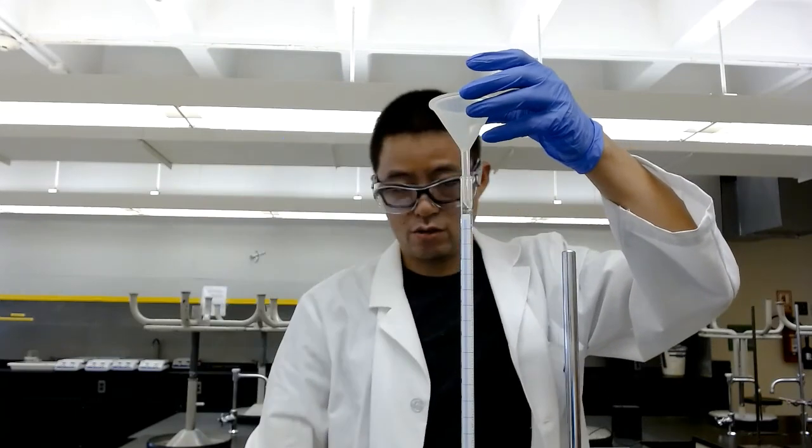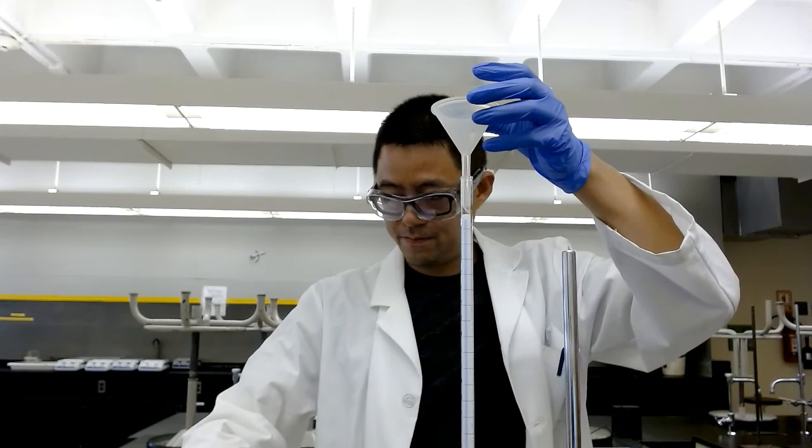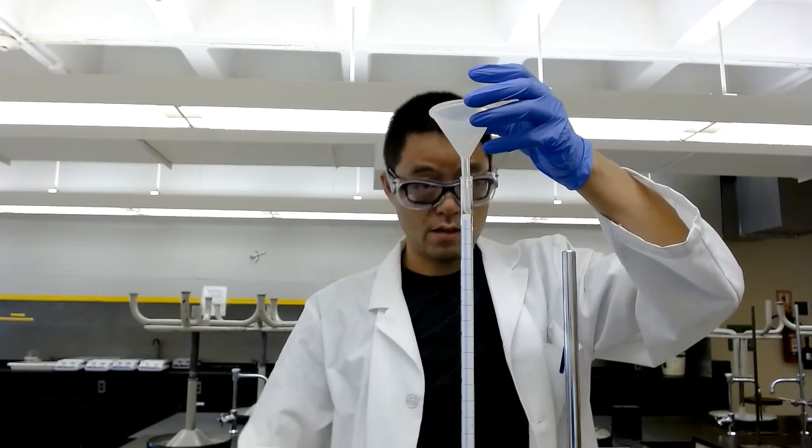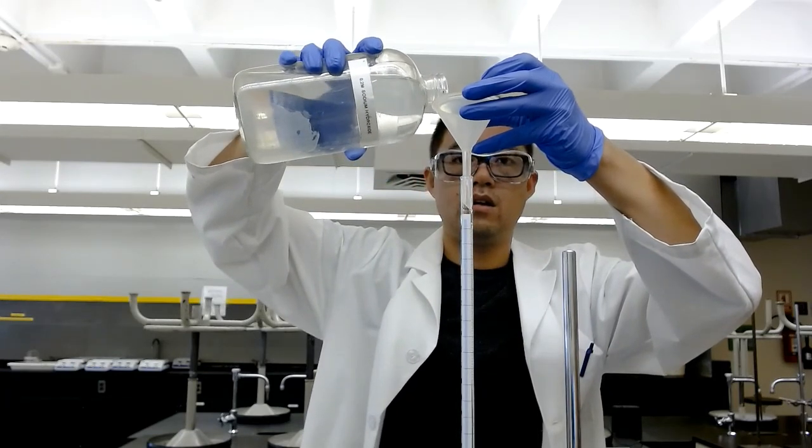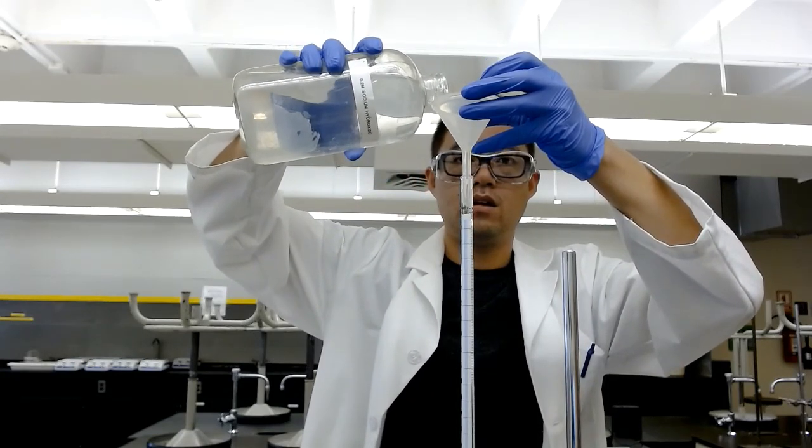You need to pour in a little bit above 0 on the top. Actually, we need a little bit more. Make sure it doesn't overflow from the top. That would be bad. But you know what, just leave it on the side for now.